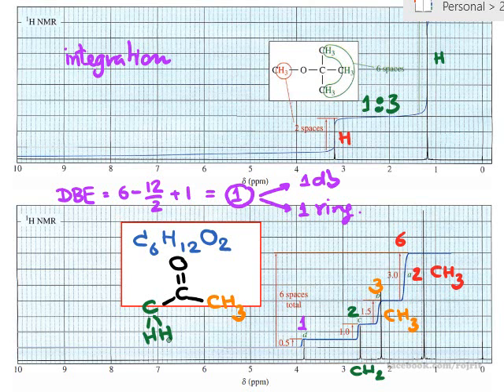What else should we have? And you have purple color here. But anyway, 2 of the red carbon, 2 of the methyl group, CH3 and CH3, they appear at the same place, right? So you have to attach them to the same atom.